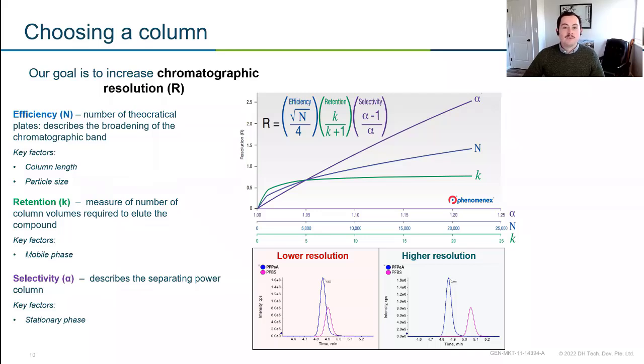And that's a good thing. We'll have more resolution, right? As the column length increases, our resolution increases, but it comes at a cost, and that cost usually is time. So if you have a 20-minute method and using a longer column means you only have to add 1 or 2 minutes to your method, that might not be a big deal. But if you have a really short method, maybe 3 minutes, 4 minutes, adding a couple minutes is a big difference. It could double the length of your method. So that's something you kind of have to consider.